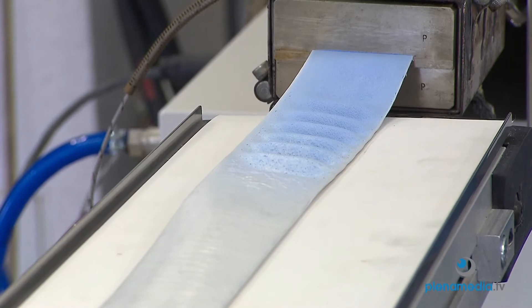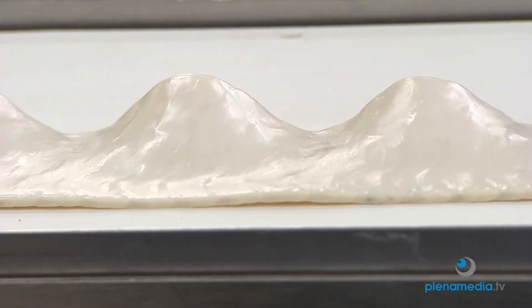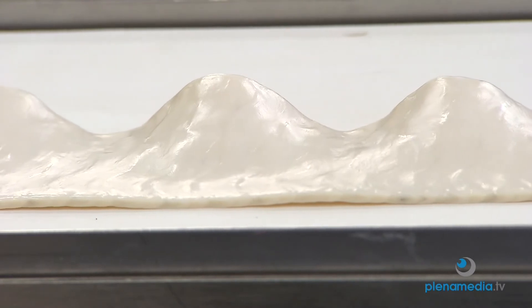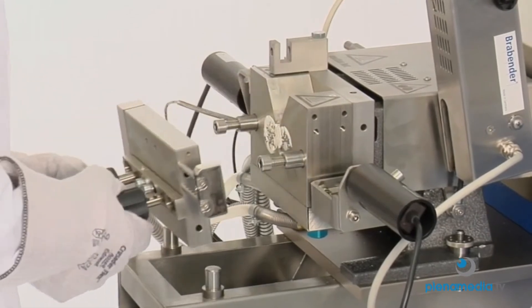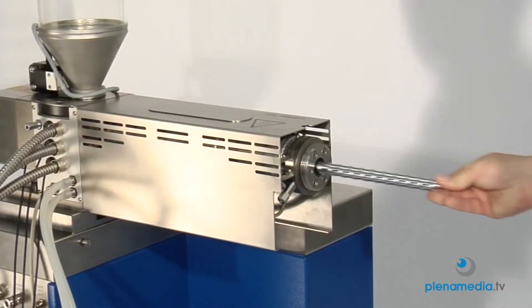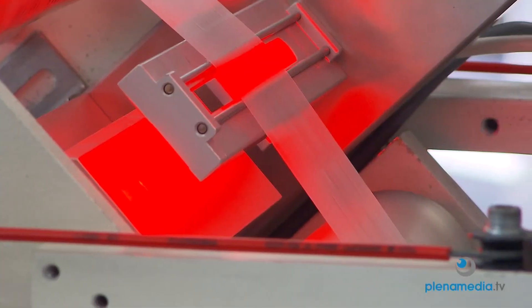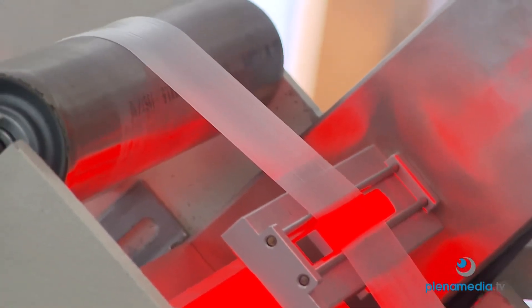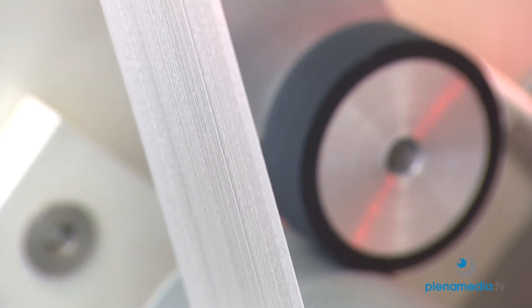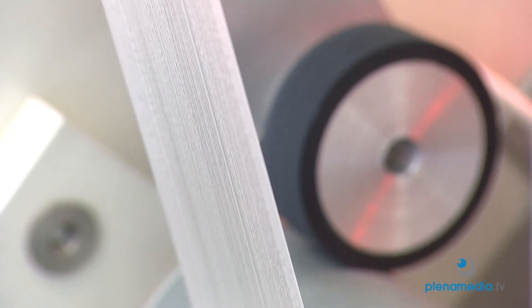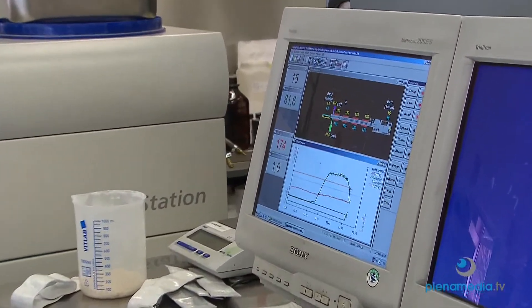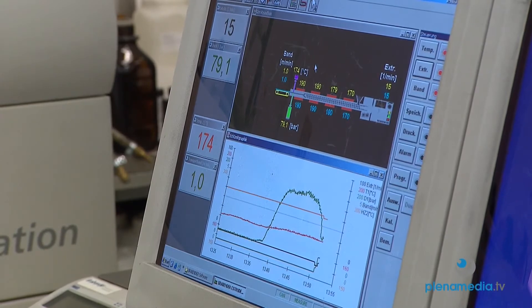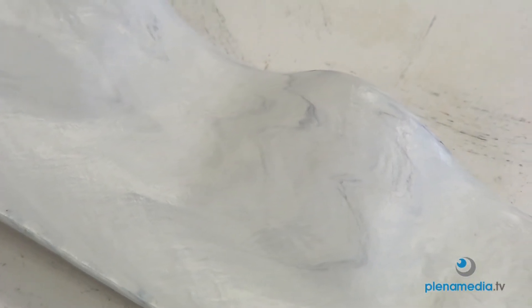The PLASDECORDER lab station allows the implementation of all key development tasks for various types of plastics. Measuring mixers and single screw extruders are applied for determining the plastification behavior of plastics, rubber and ceramic compounds. Material-typical plastigrams are generated which allow conclusions regarding the flow behavior of the material. Furthermore, practice-oriented extrusion is performed, and extrudates like strands, plates, ribbons or films can be inspected with respect to various criteria.